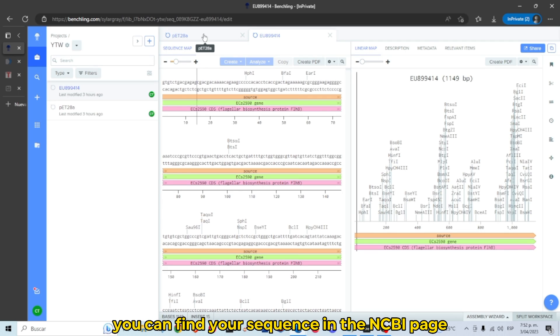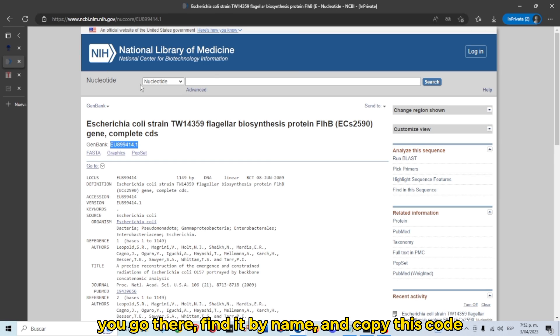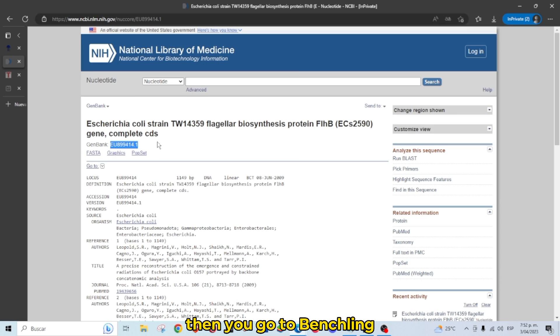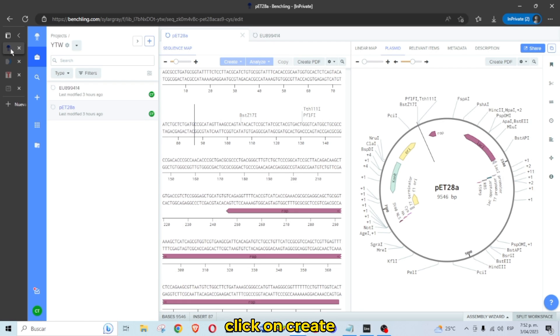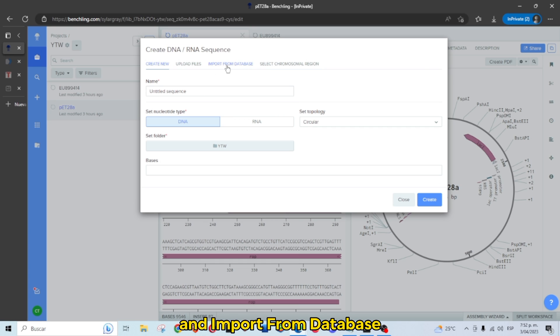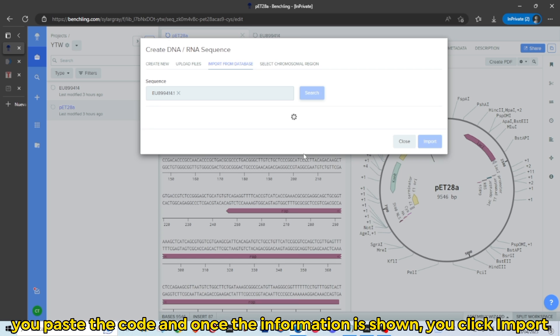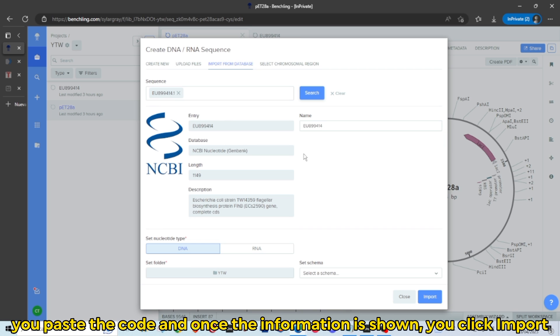You can find your sequence on the NCBI page. Go there, find it by name, and copy the accession code. Then go to BenchLink, click on Create, DNA Sequence, New DNA Sequence, and Import from Database. Paste the code, and once the information is shown, click Import.